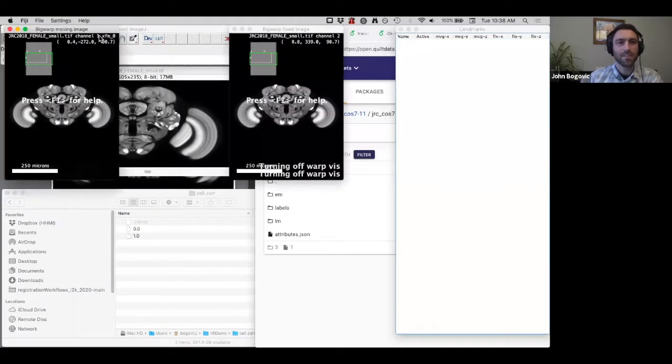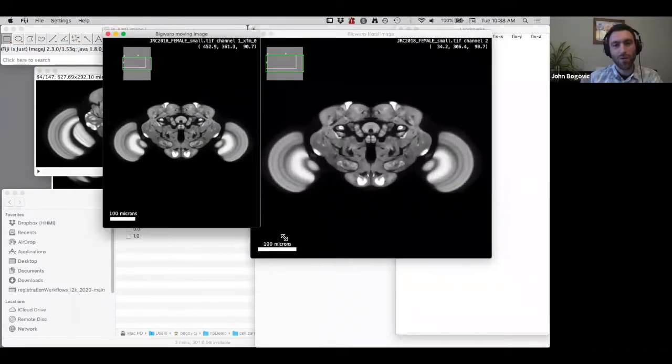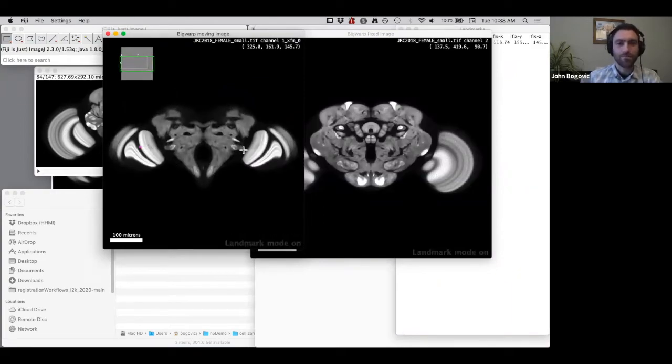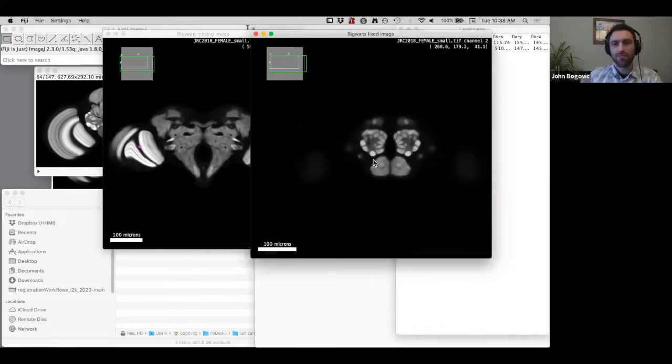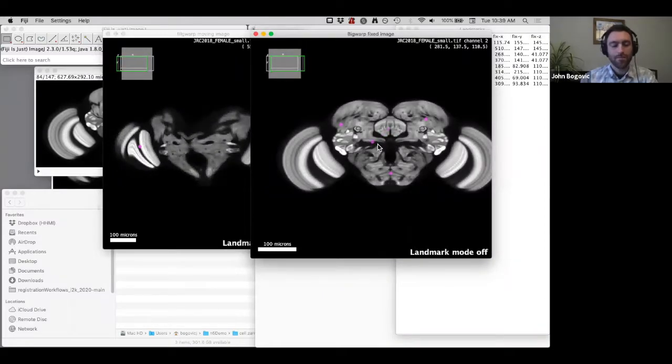And this is going to be a little bit contrived, of course, because this image is not that big, but I'll try to explain why this is useful as I make a silly little transformation. Ordinarily, when you write a transformed image, you will allocate a bunch of memory that contains all of the pixels that you have transformed. And then you apply the transform and write it into the memory that you allocated. And then all that memory that you allocated, you write it to disk.